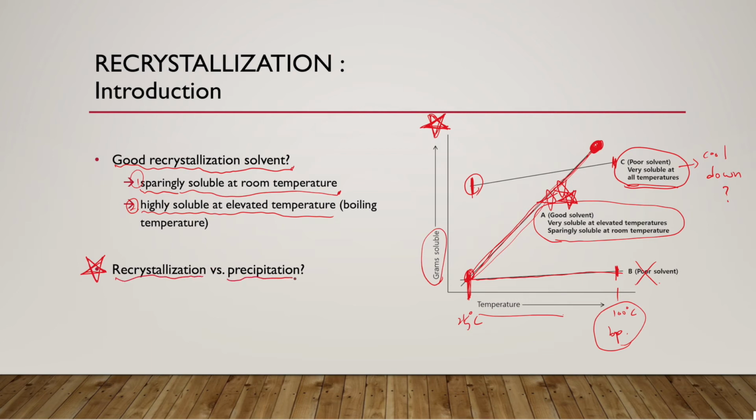but there's another term for solidifying organic compounds. Another term you have probably heard before is called precipitation. So now you need to consider the difference between these two.